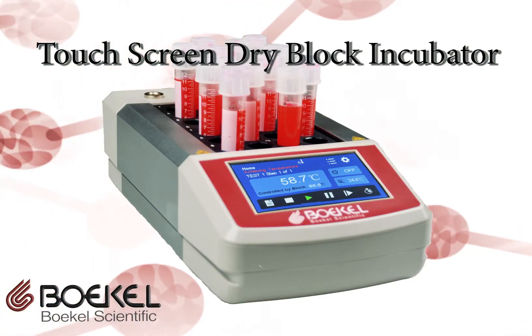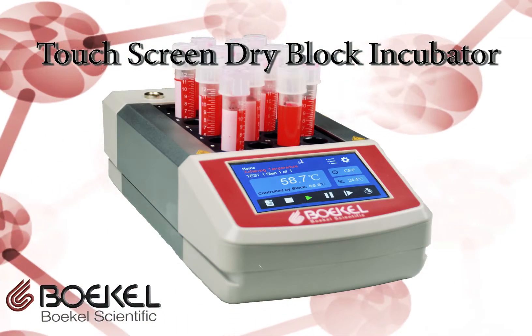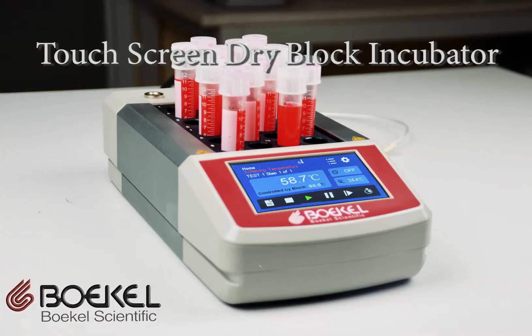Introducing the new Boekel Scientific Touchscreen Dry Block Incubators. These programmable sample heating blocks are accurate, advanced, and affordable.